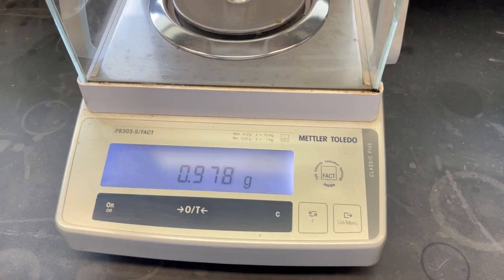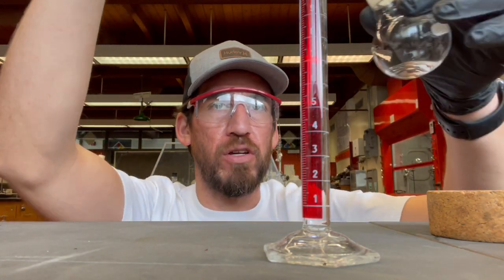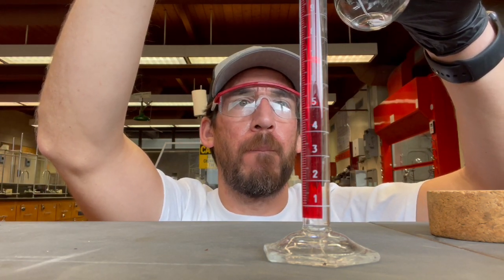All right, well, okay. So what I want to do is just kind of get the volume of this. I want to see how much ethanol I got out of this.